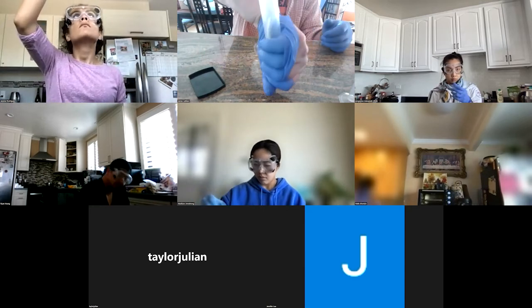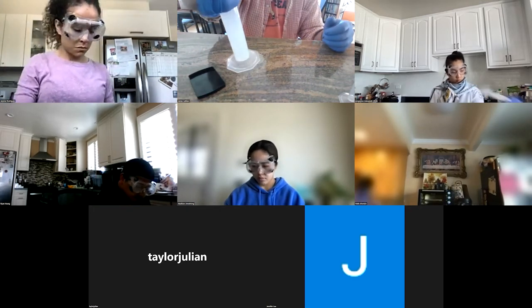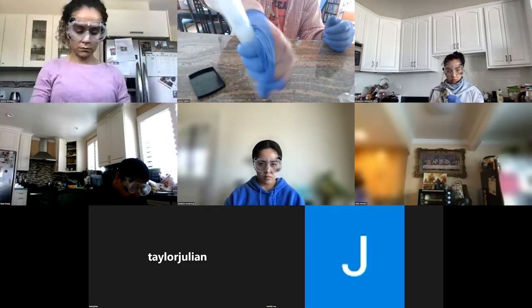It doesn't say anything in the instructions about how long it's supposed to take to go into solution. Supposedly you gently stir it. Yeah, I don't think so.